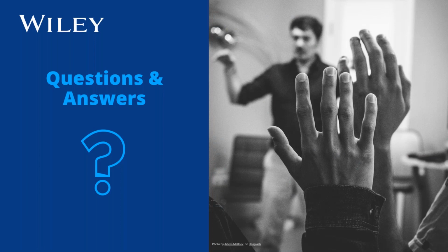Basically, when the user needs to do something or input some data, something pops up on the screen asking for that in some way. So it's pretty user-friendly in that way. And there's also a lot of training documentation online. I was actually following along with some of the training documents for quantitation that are posted on our website for the demos today.